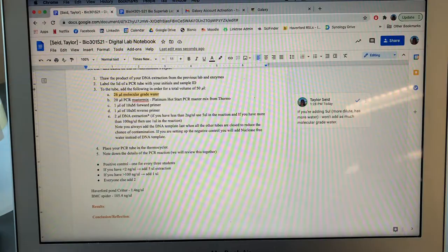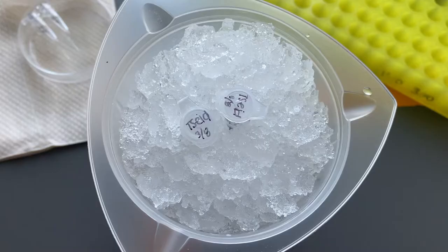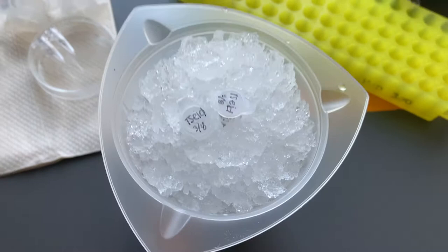So it's time to head into the lab. First, I labeled two PCR tubes, one for my duck pond target barcoding sample and the other for my Bryn Mawr pond target barcoding sample. With my extracted DNA samples, I put them on ice while preparing the PCR tubes.